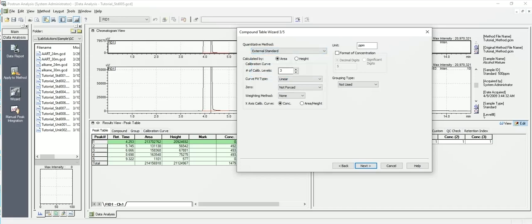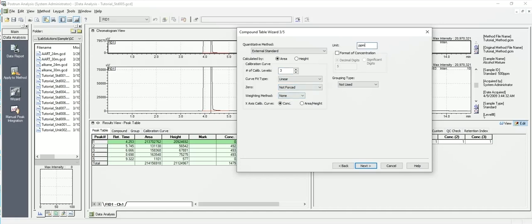And we're going to say we're going to be using area, three points of three levels. It should be linear, whether or not we want to force it through the origin or not, that's up to you. And we're not going to worry about weighing methods right now, and the units, whatever they may be. So I'm going to leave those blanks. I'm not sure what units they'll be.